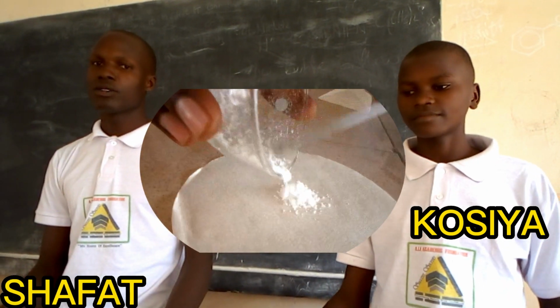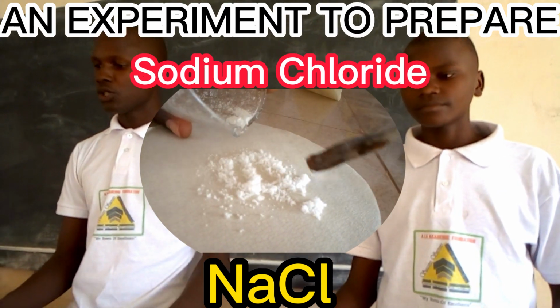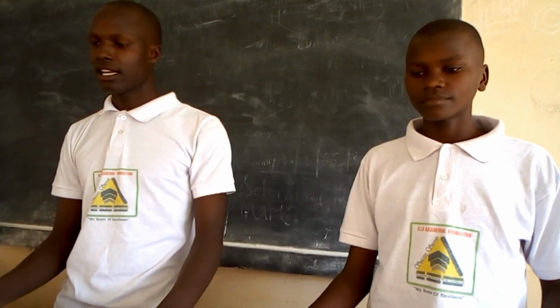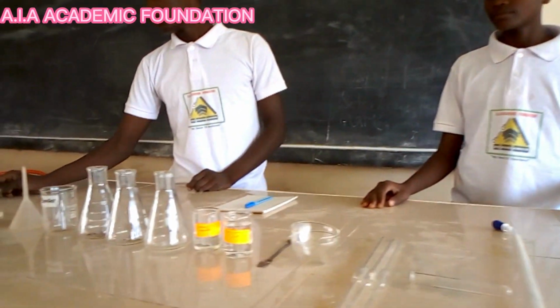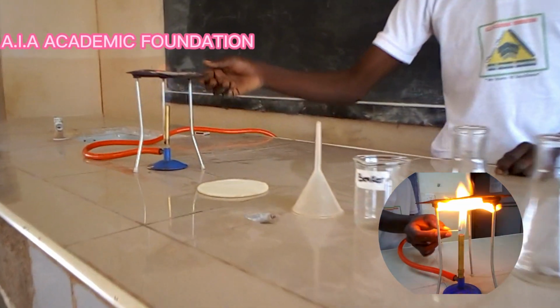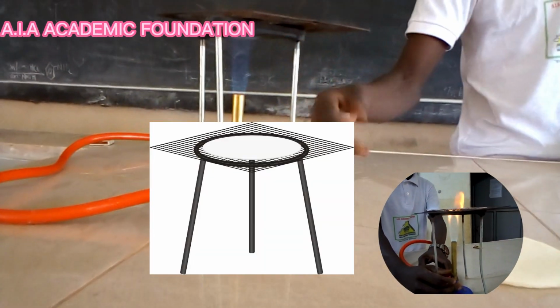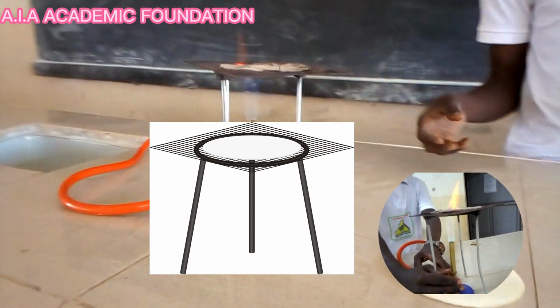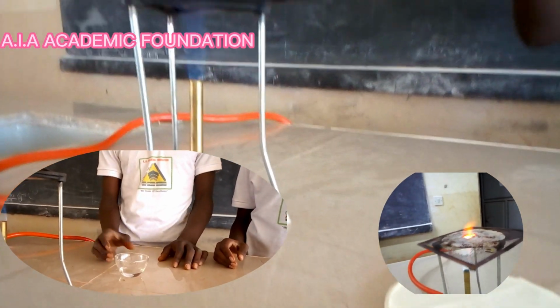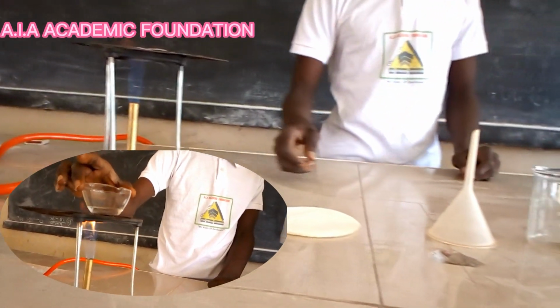We have come here to carry out an experiment about preparation of sodium chloride, whereby we shall use the above solutions and the apparatus, which I will introduce by their names. We have the burner, the fire source, which is used to spread the fire for heating. We have the tripod stand, which we shall use to raise up and put on the evaporating dish.